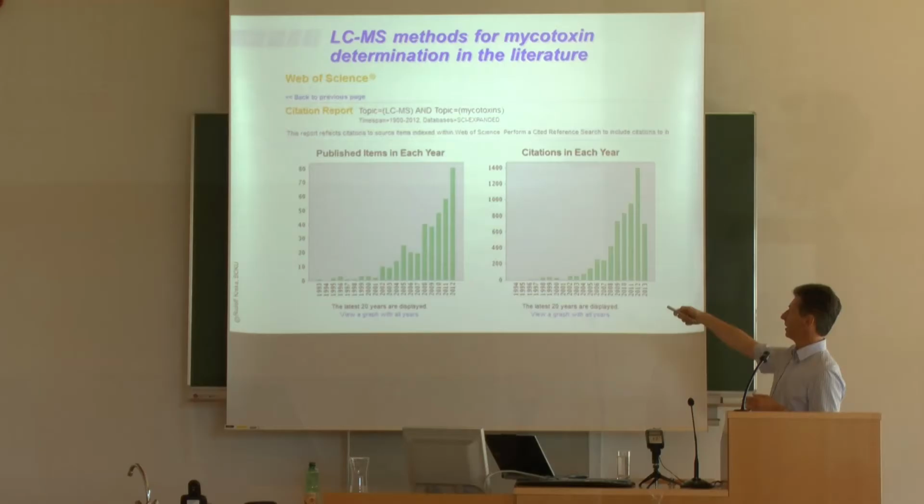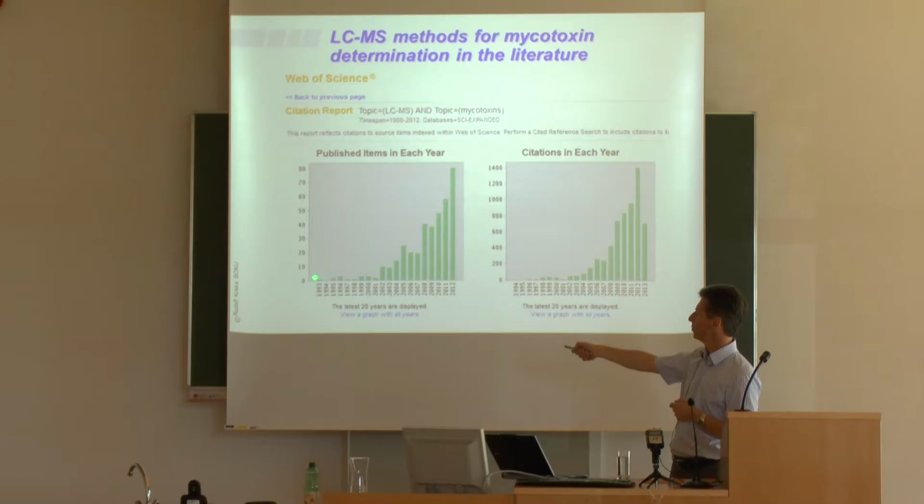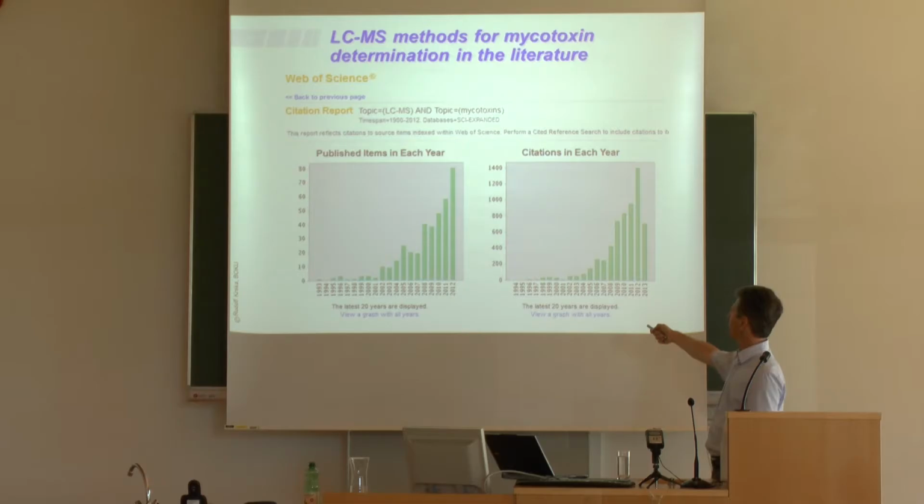LCMS method for mycotoxin determination in the literature, quite impressive, published items in each year, 1993, I think two or three papers. One of those was from our side in collaboration with the TU Vienna. Now we've got about 80 papers, 2013 will be higher. But the citation each year of LCMS-based methods is quite impressive.